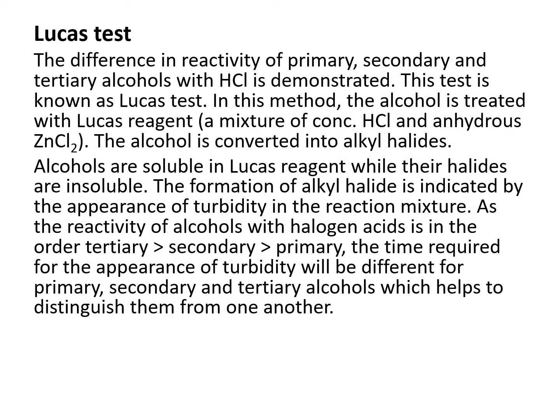And the Lucas test. The difference in reactivity of primary, secondary, and tertiary alcohol is demonstrated in the Lucas test. In this method, the alcohol is treated with Lucas reagent, which is a mixture of concentrated hydrochloric acid and anhydrous zinc chloride. The alcohol is converted to alkyl halide. Alcohols are soluble in Lucas reagent, while the halides are insoluble. The formation of alkyl halide is indicated by the appearance of turbidity in the mixture.